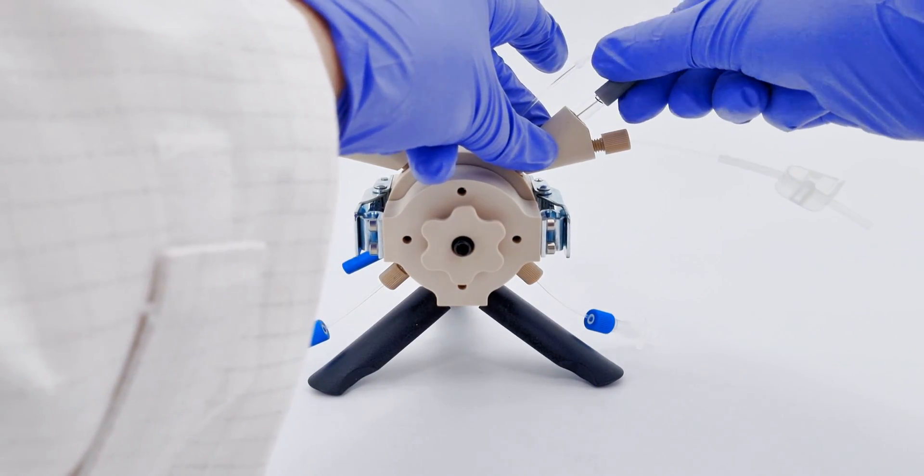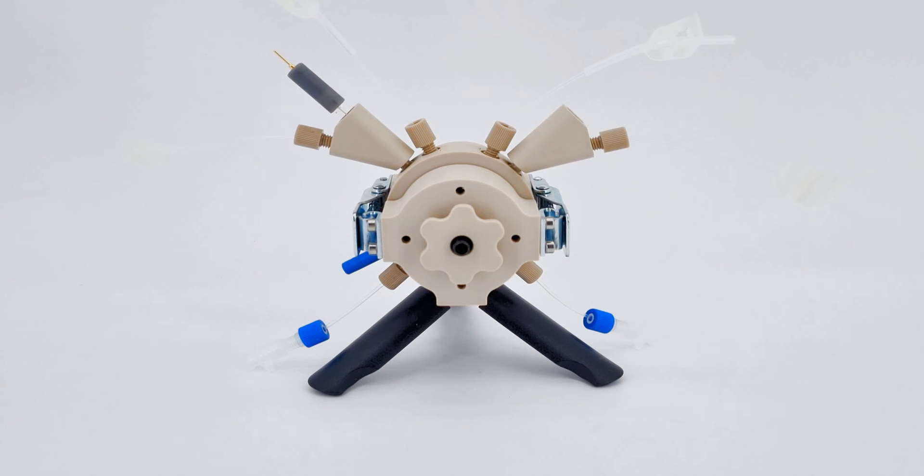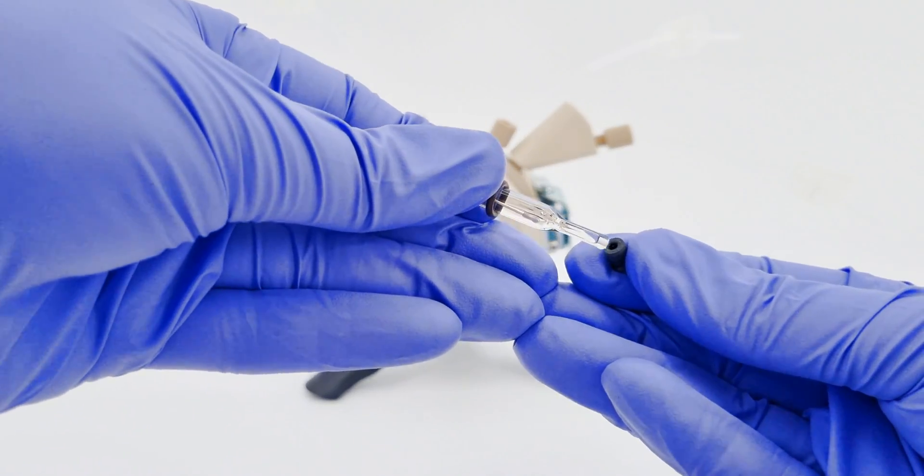To remove the reference electrodes, apply a gentle twisting and pulling motion. Once removed, clean the electrode and promptly replace its cap. This ensures the integrity and cleanliness of the electrode.